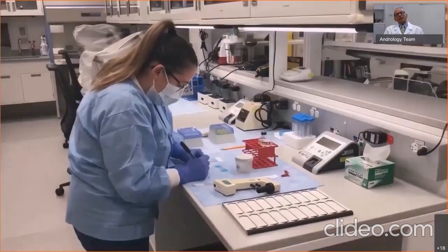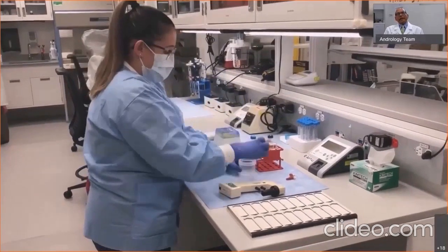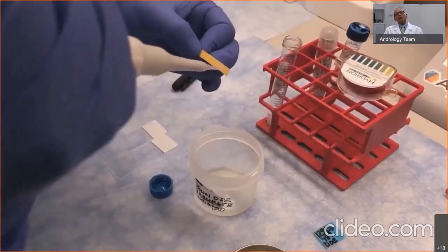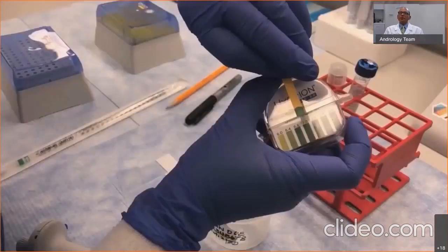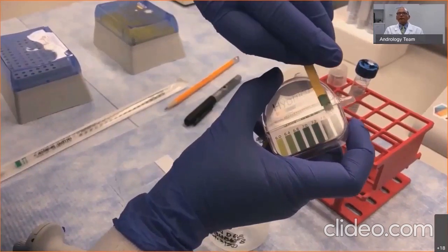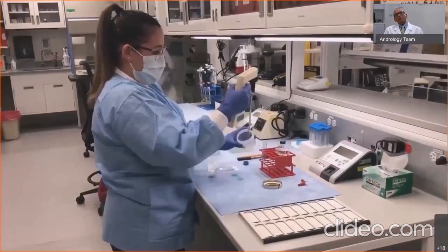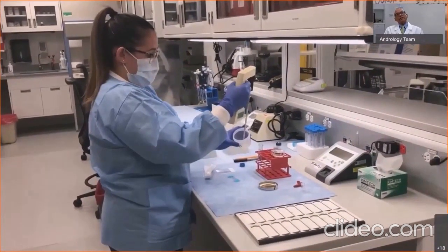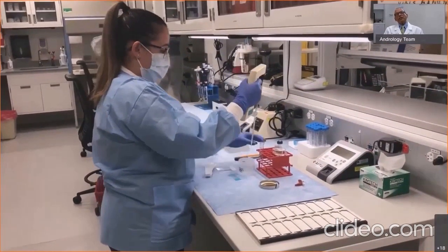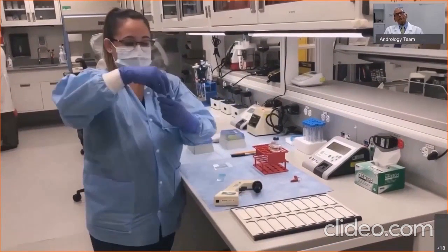The technologist is labeling the tube in which the sample will be transferred from the collection container. And the first thing is to check the pH of the sample, and a small drop is placed on the litmus paper or the pH paper and checked for the pH of the sample. The next step is to vortex the sample. But before we do that, it is important that the sample is carefully transferred from the collection container into the graduated centrifuge tube using a serological pipette.